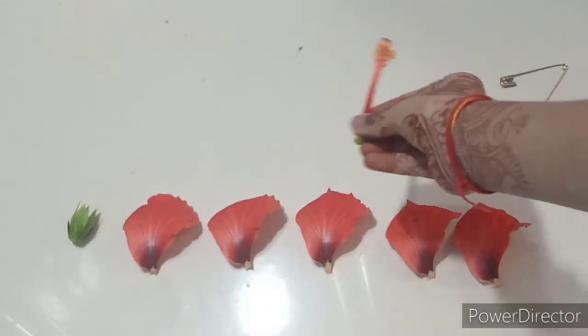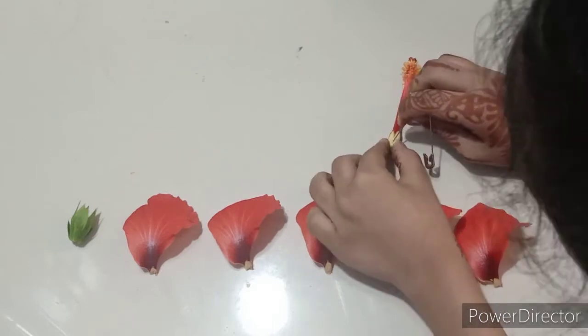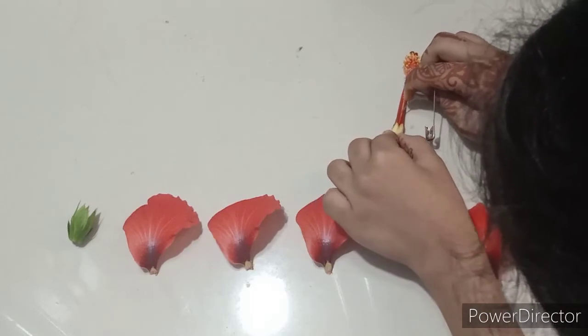Now we are going to obtain the parts of the stamen and the pistil. To do this, I will take my safety pin and start by dividing this in half, as you can see in the video.